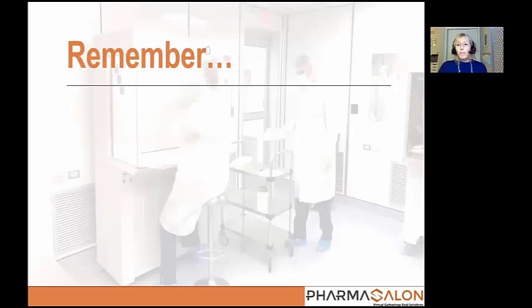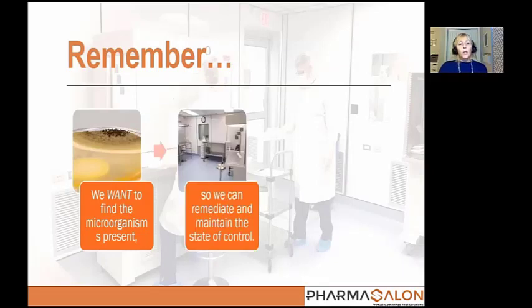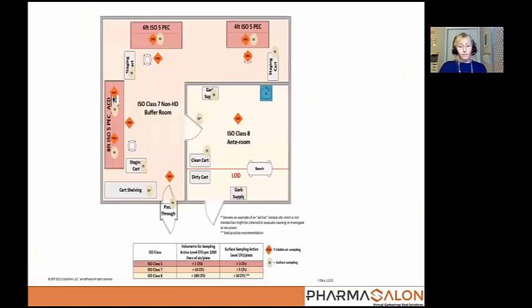What I want you to remember here and walk away with is that we want to find the microorganisms that are present so that we can remediate and maintain that state of control, because ultimately that remediation effort is going to lead to process improvement. And really, that's what we're working towards.